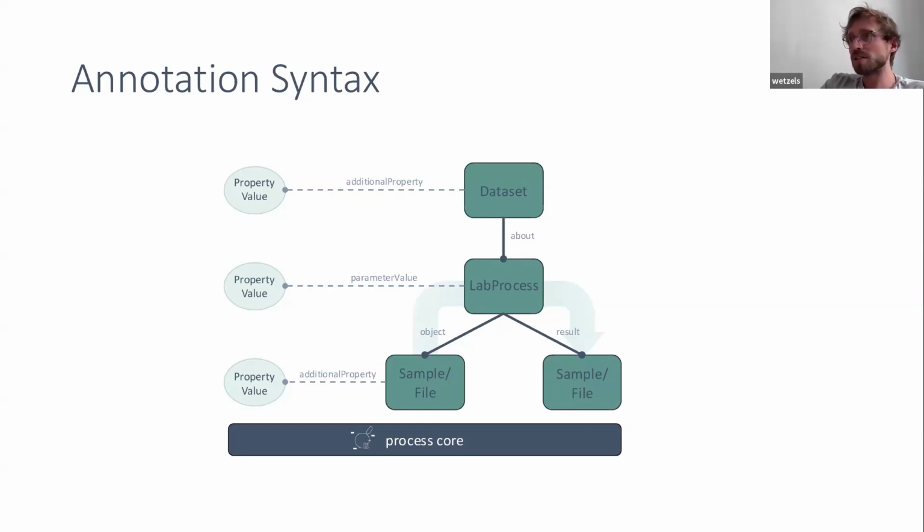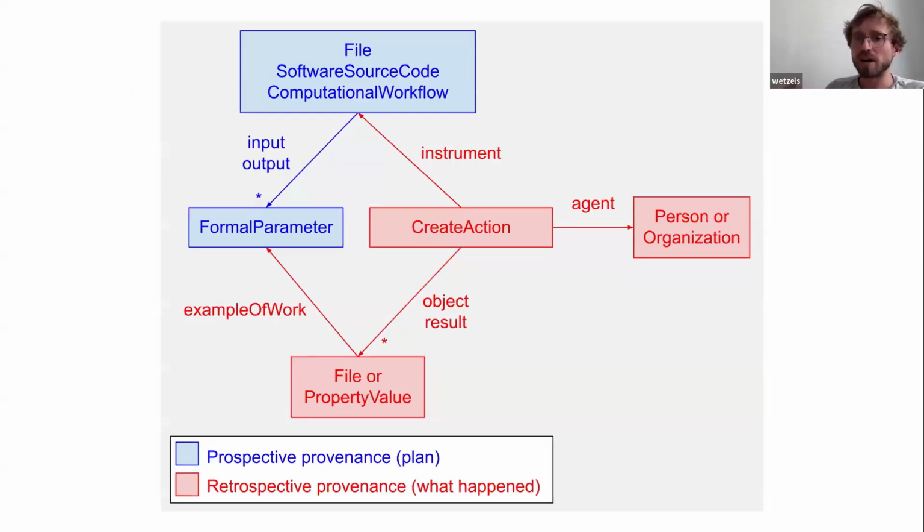In addition to this, we want to incorporate the perspective that's also present for computational workflows, the separation between prospective provenance and retrospective provenance.